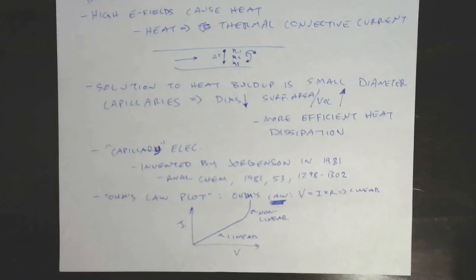Okay, these are some principles of capillary electrophoresis. We are going to keep talking about some neat properties that mechanisms like electroosmotic flow offer to these separations in the next part of the lecture.